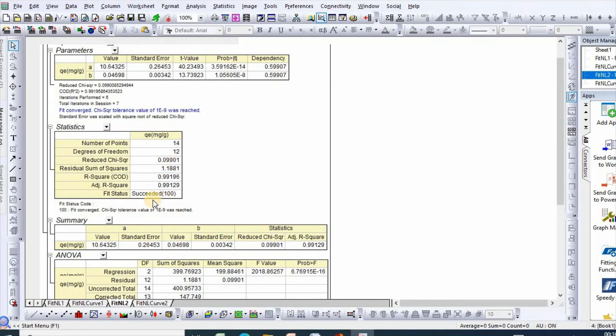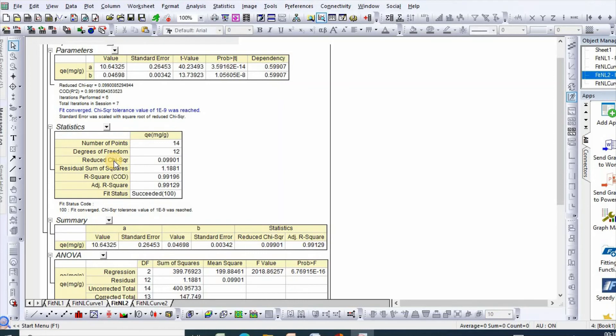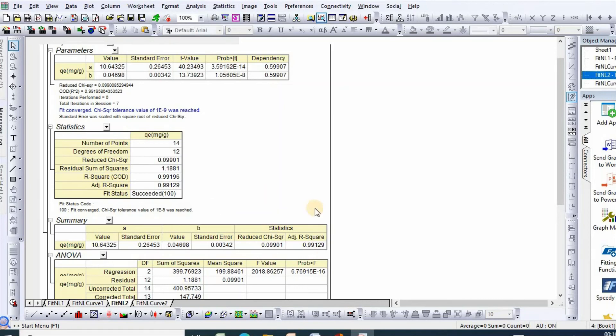From Origin we can easily analyze five types of errors, which are reduced chi square, residual sum of squares, R square, and adjusted R square.